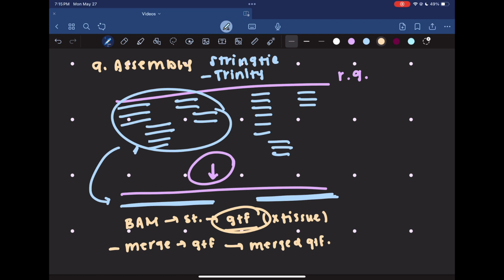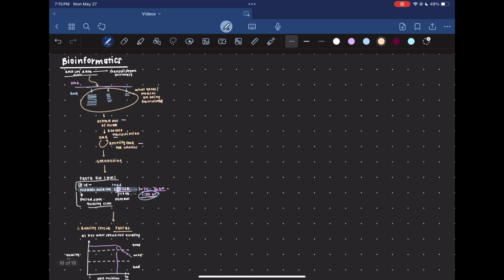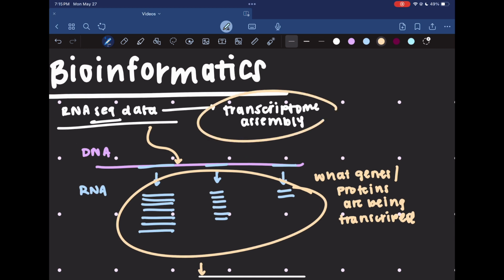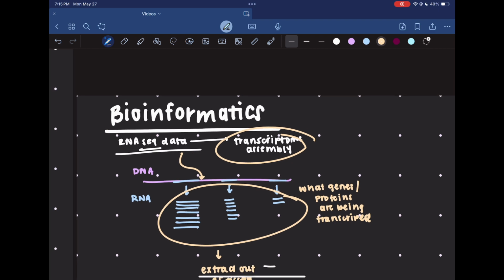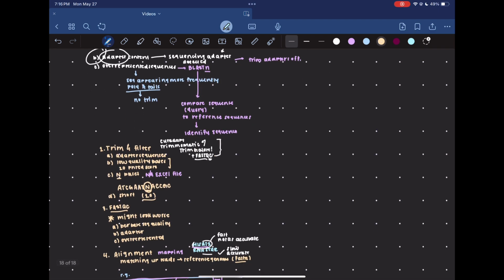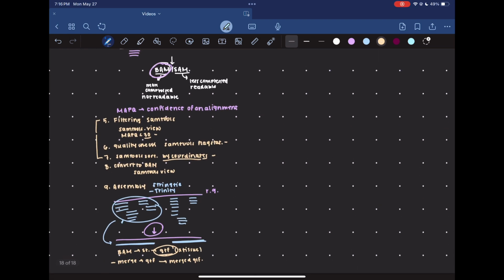After that, you officially have an assembled transcriptome. That was the process, start to finish, that I initially indicated I wanted to do, where I said I want to go from my RNA-seq data all the way to transcriptome assembly. So after StringTie, we have officially assembled a transcriptome. But as I've hinted at throughout the video, all of these file types are very difficult to look at on their own because there's so much data.